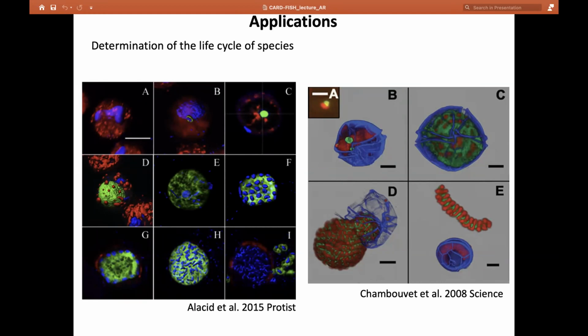We can reconstruct the situation inside the cell where the parasite is located. Okay, and here we can follow all the life cycle thanks to the amplification and the hybridization of the probe. This is exactly the same for Amoebophrya. In this case, the genetic material is in red, and the probe in green again.